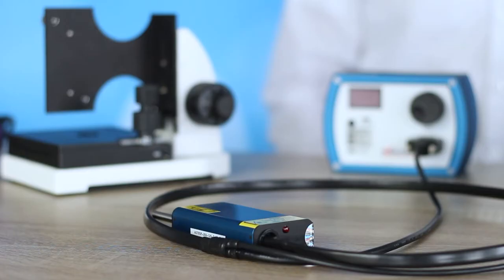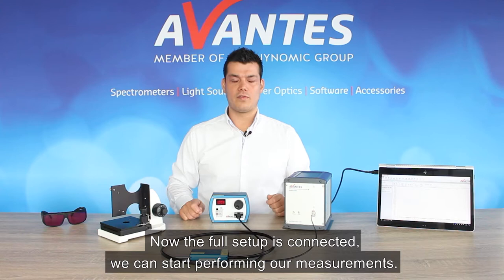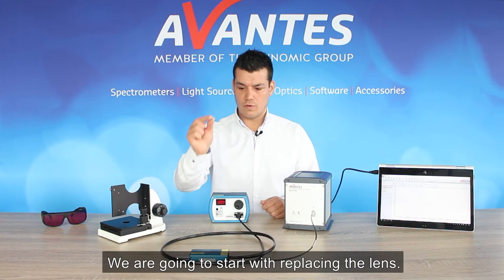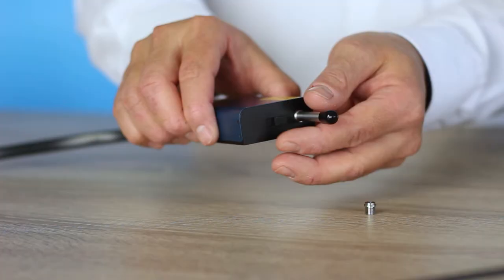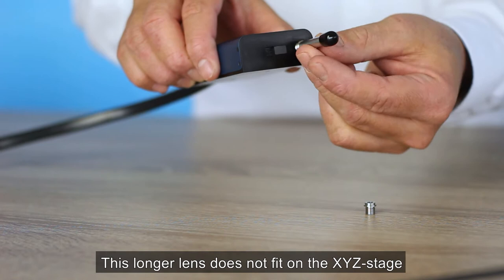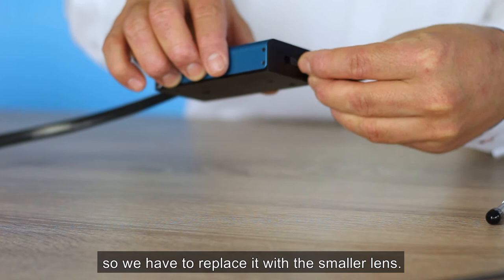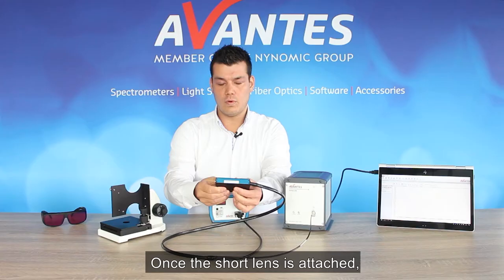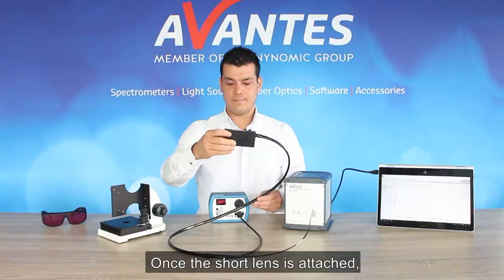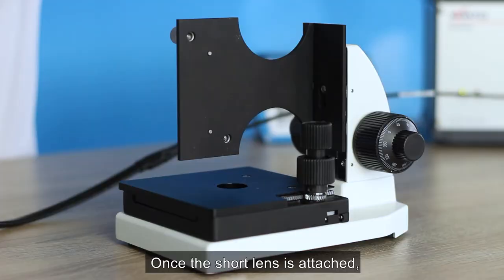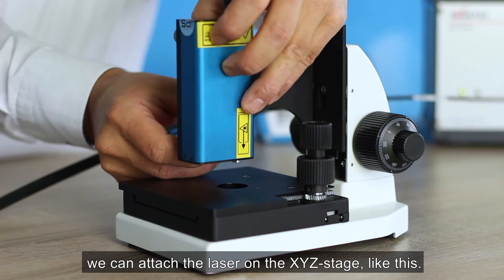Now the full setup is connected, we can start performing our measurements. We're going to start with replacing the lens. This longer lens doesn't fit on this XYZ stage, so we have to replace it with a small one. Once the short lens is attached, we can attach the laser on the XYZ stage like this.